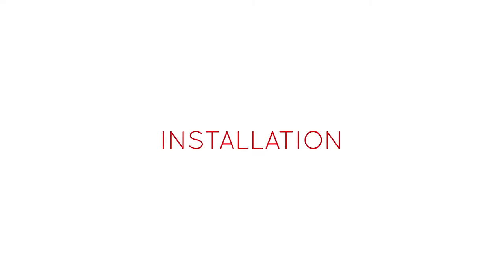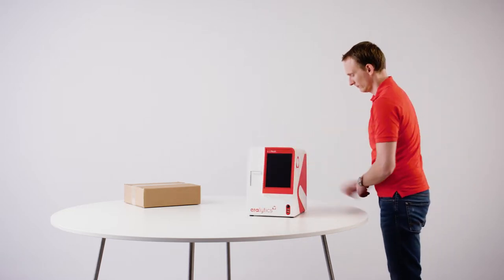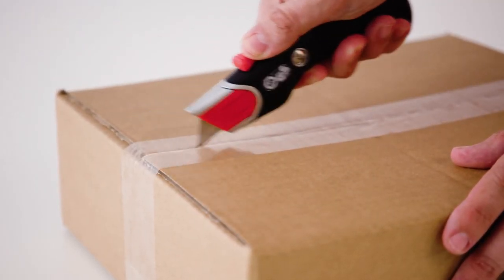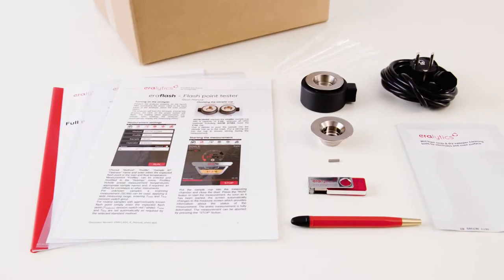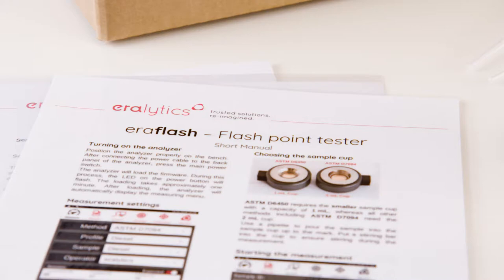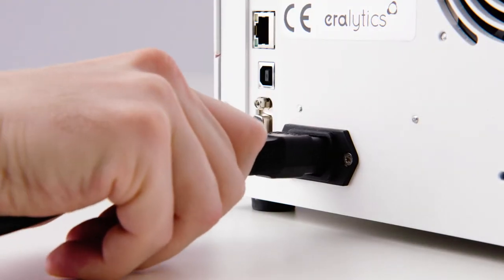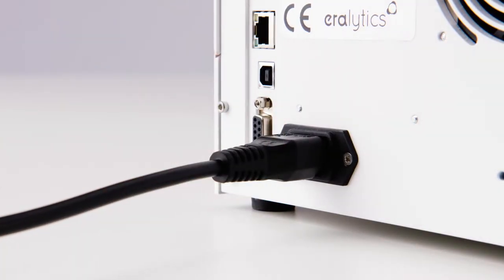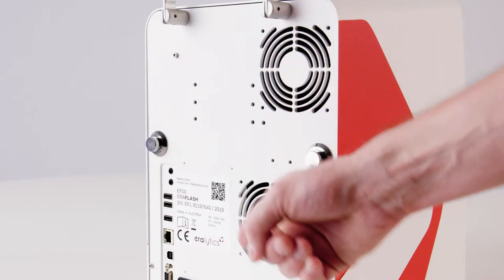Installation. Place the instrument on a stable benchtop. Open the accessory box — it contains instrument-specific items, the printed short manual, and the USB drive containing the full user manual. Plug in the power cable on the rear side of the instrument. Make sure that the vent holes are not obstructed.